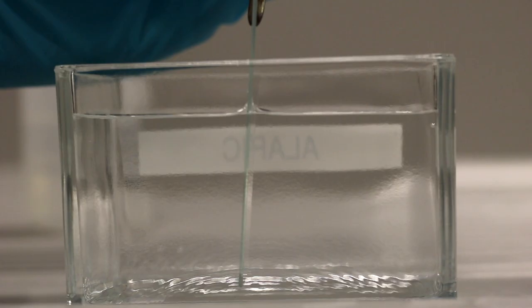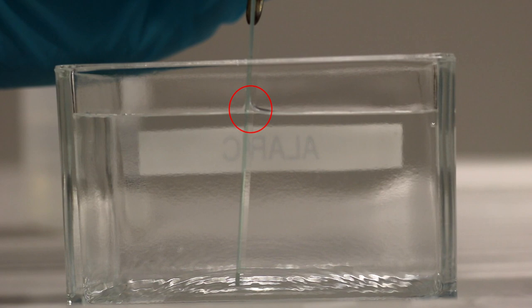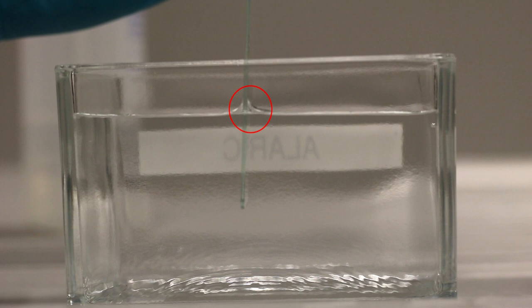For example, with a hydrophilic material such as glass, the substrate is withdrawn from beneath the surface in order to form a steadily receding drying line, the point at which the molecules or particles which are mobile at the interface become immobilized on the substrate.